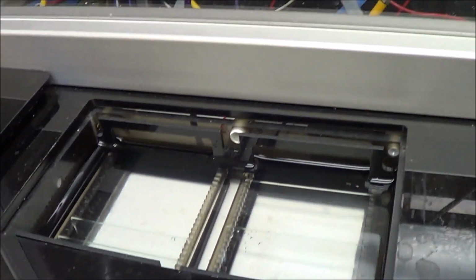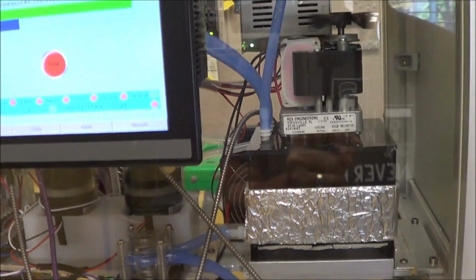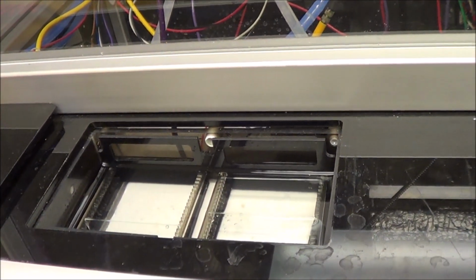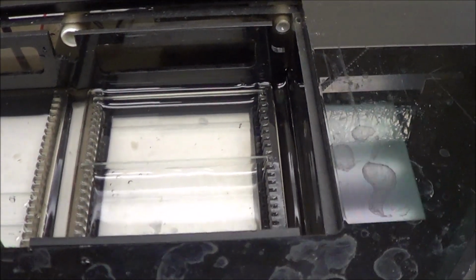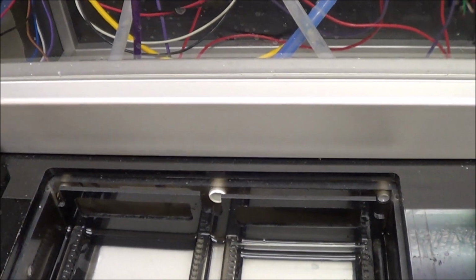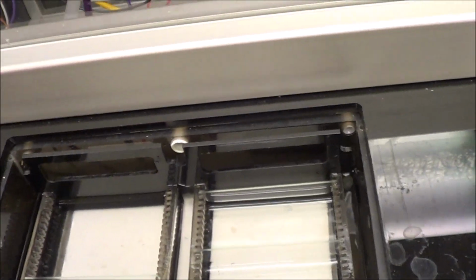Once we've evacuated the distilled water, if the chill tank is at temperature, which it is, we'll just transfer the electrophoresis fluid to the process tank. So we're at the right temperature, and the cooling system has shut itself off to maintain that temperature. Now we're waiting for the process tank to be evacuated.